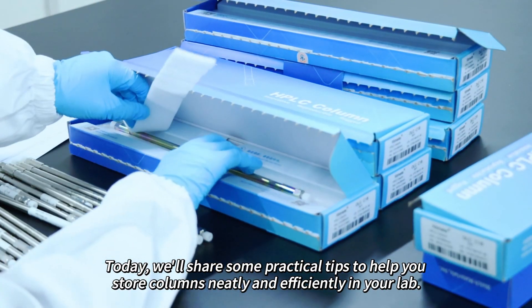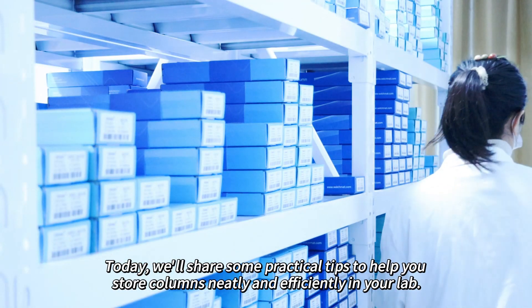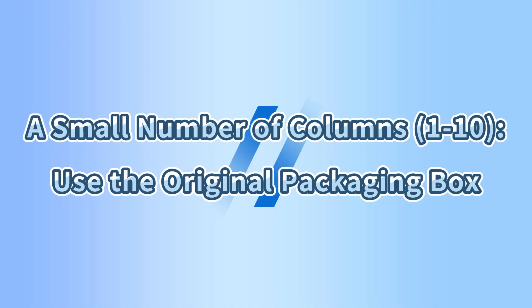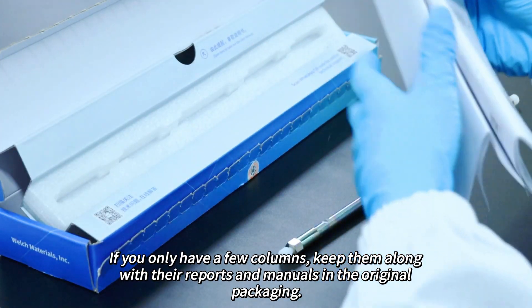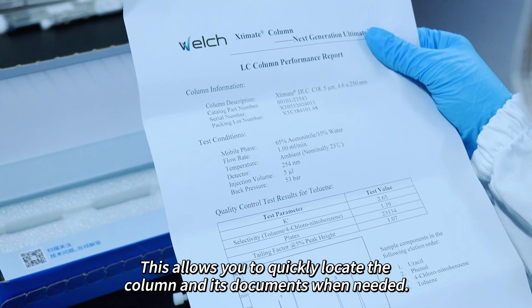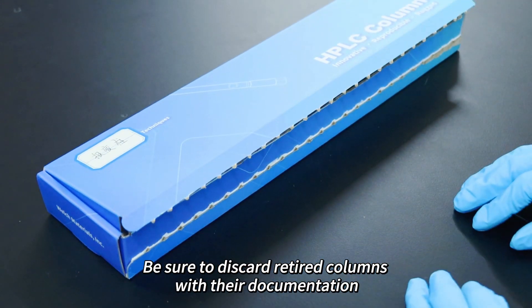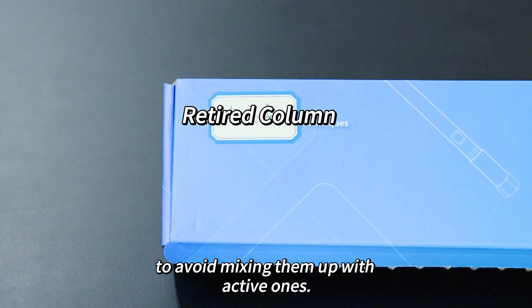Today, we'll share some practical tips to help you store columns neatly and efficiently in your lab. If you only have a few columns, keep them along with their reports and manuals in the original packaging. This allows you to quickly locate the column and its documents when needed. Be sure to discard retired columns with their documentation to avoid mixing them up with active ones.